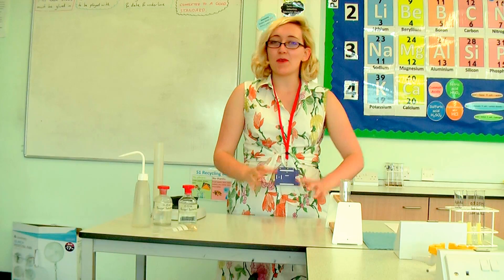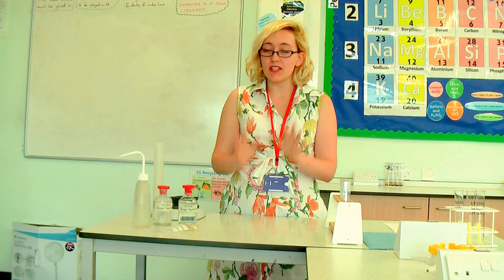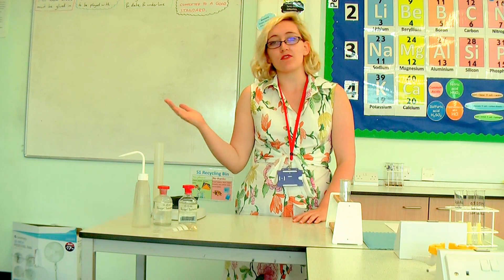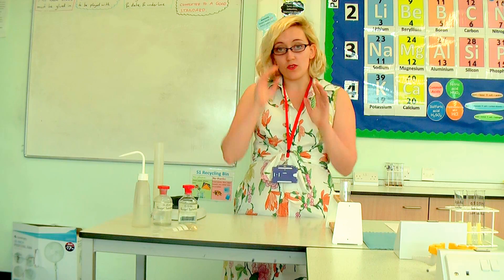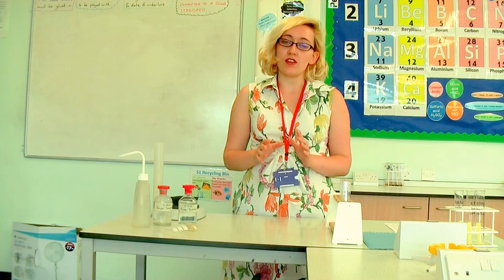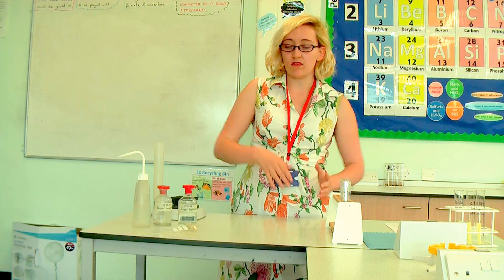Hello everyone, and today we're going to be doing the AQA biology required practical on osmosis. We are going to be looking at how potato cells take in or lose water when we add them into different concentrations of sugar solutions. You should already know that in osmosis, if a solution has got more water in it than the potato, the water will move from the surrounding solution into the potato.